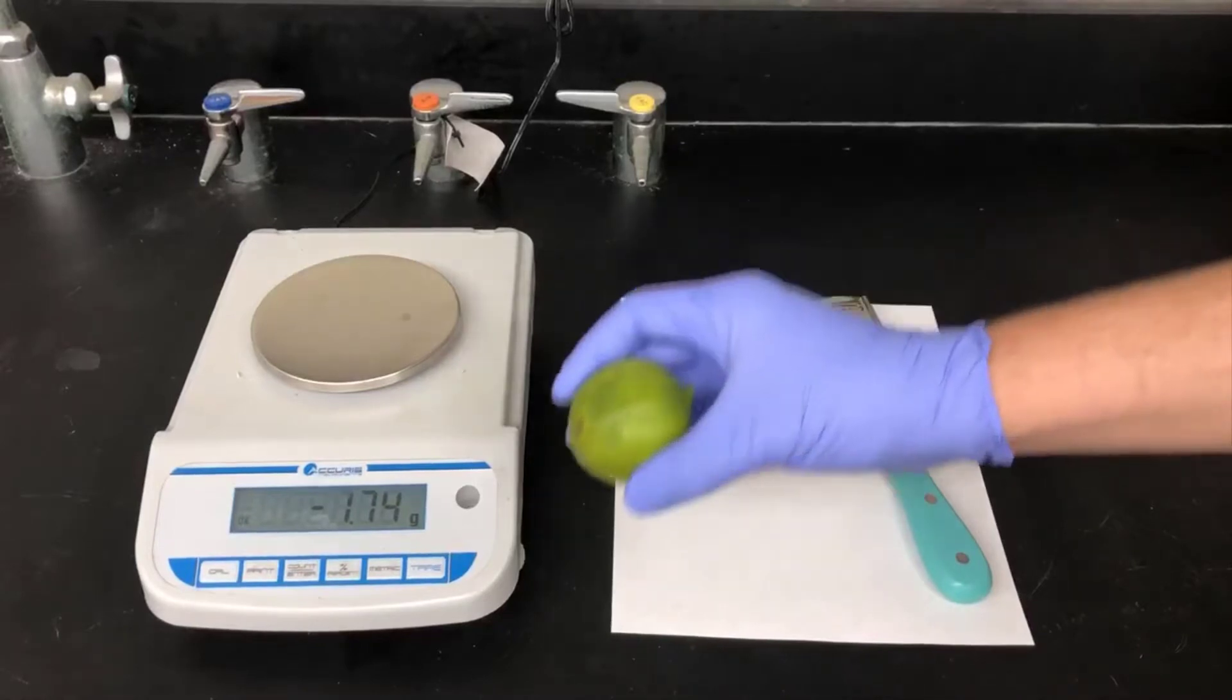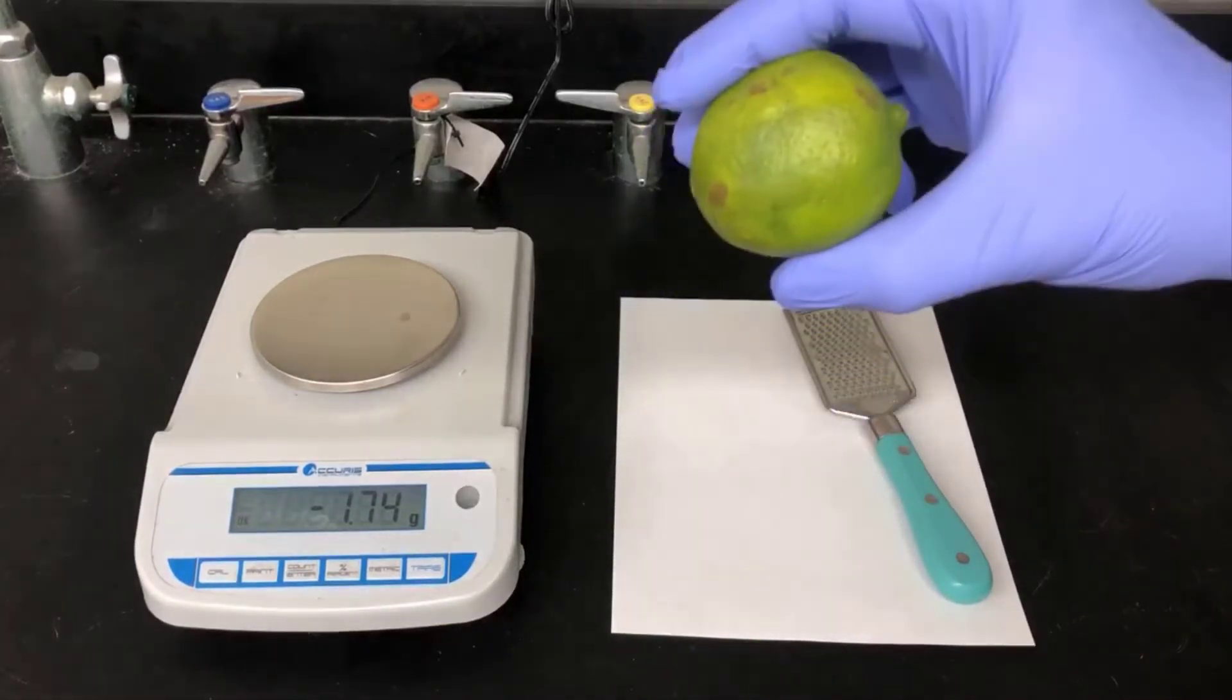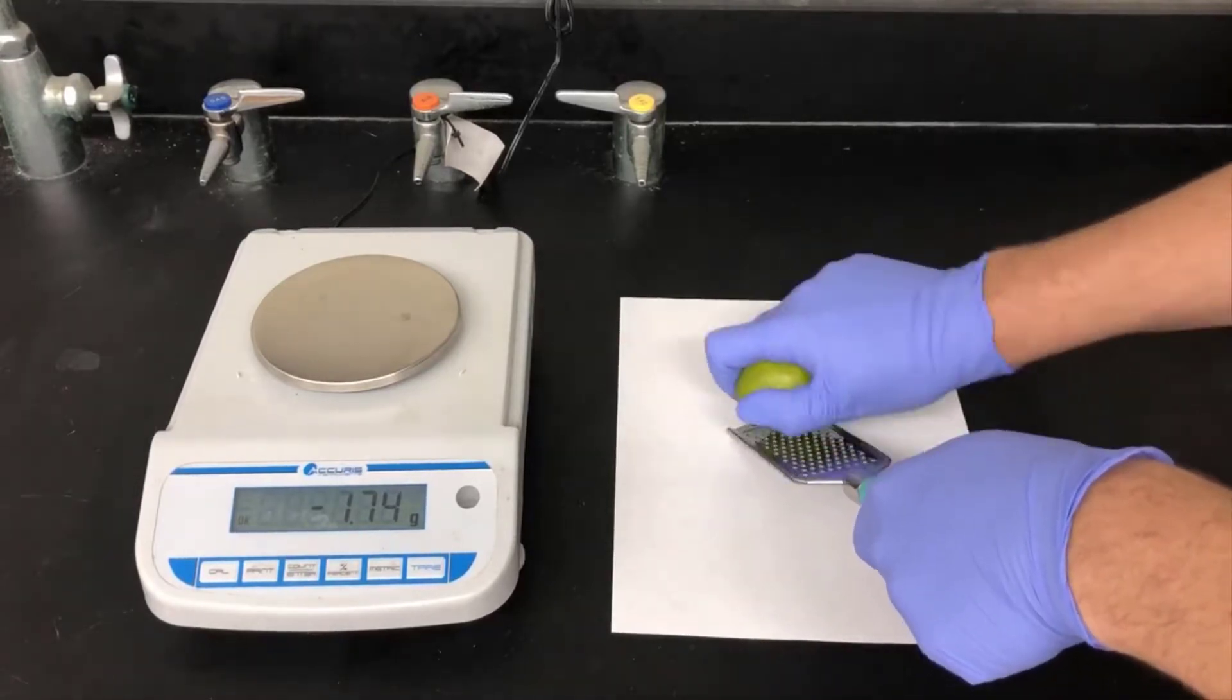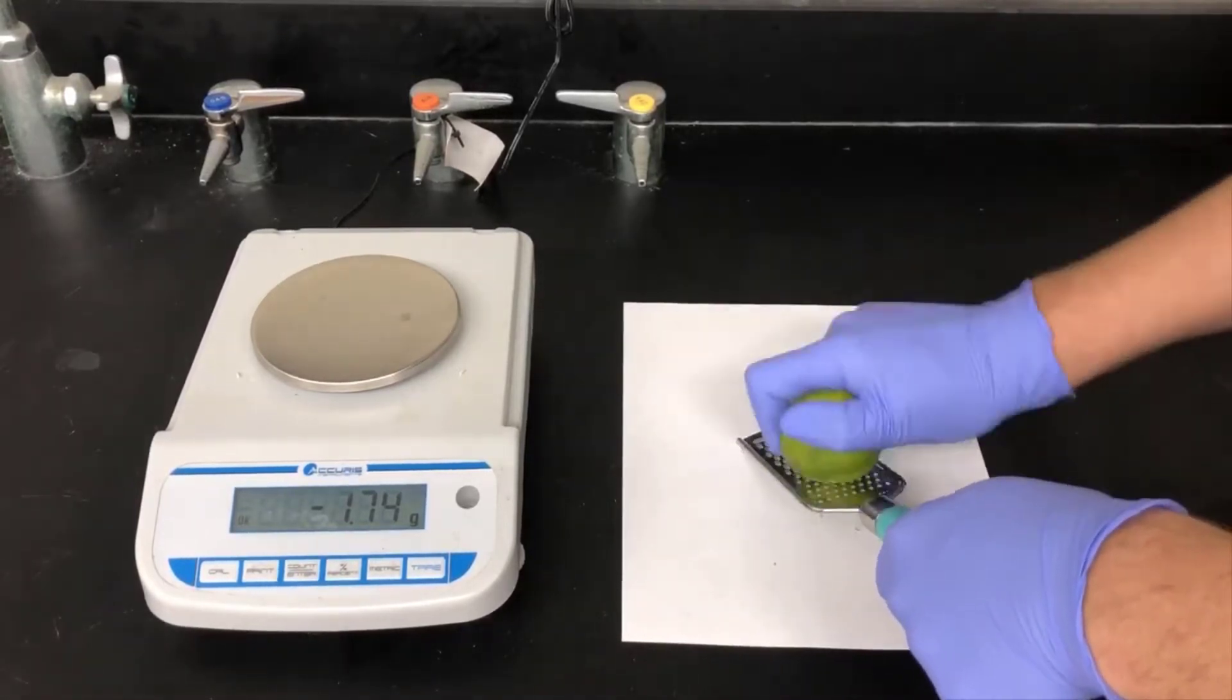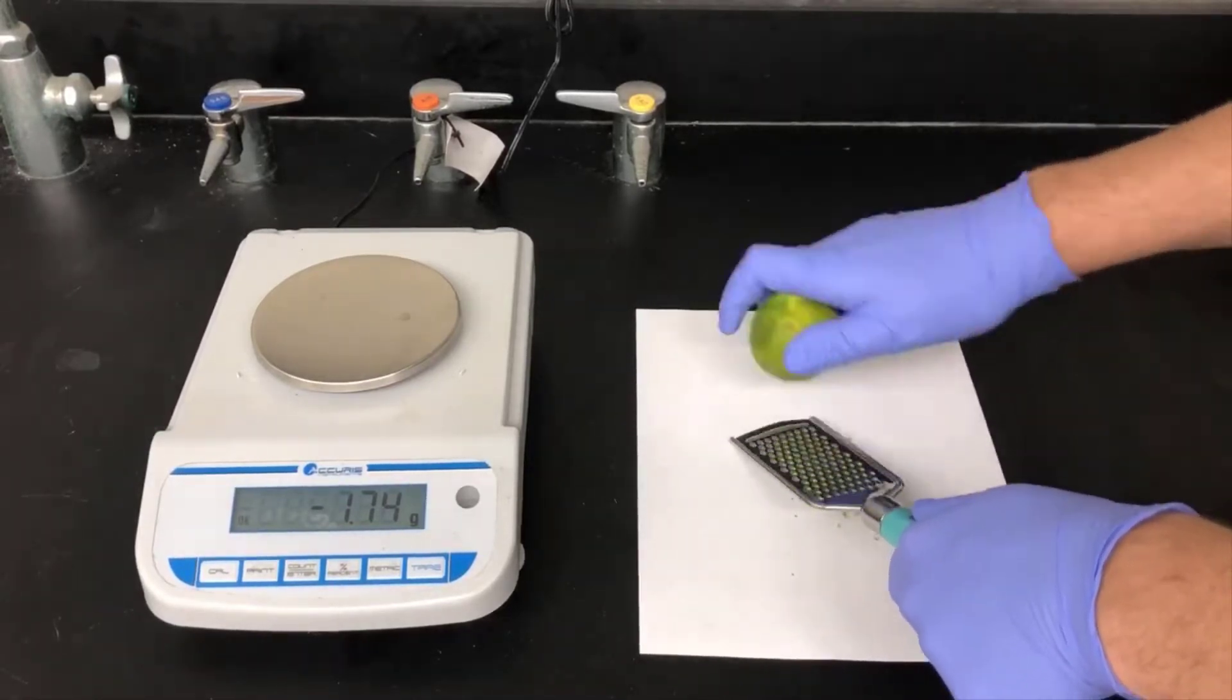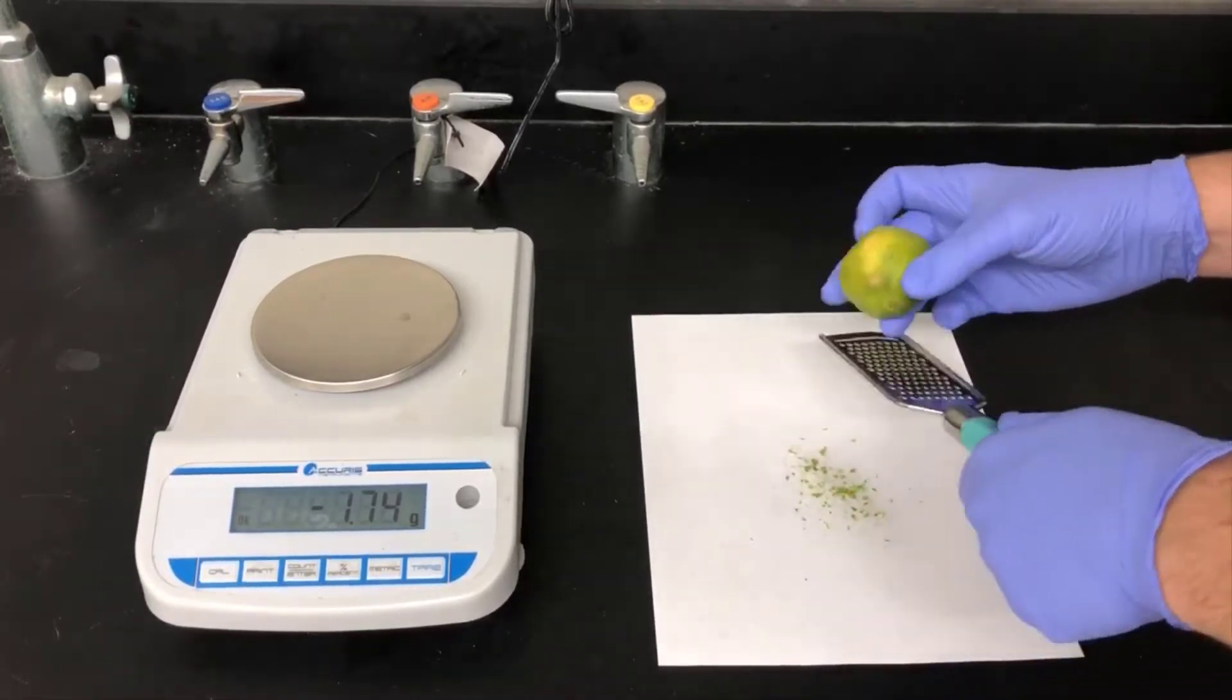I'll start by selecting a citrus fruit. I'll be using a lime today. I'll take that lime in a standard food grater and grate the outside of the lime to generate zest of lime. This is the shiny outer part that contains most of the essential oil. The inner pith part, the white part, doesn't contain as much so avoid that part if you can.